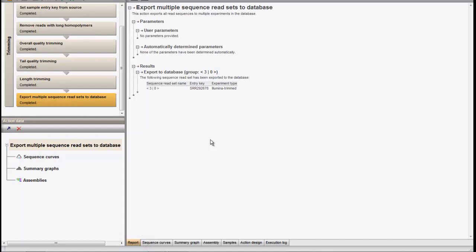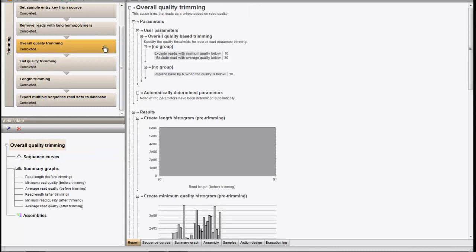From the report, the different parameter settings for each trimming action are displayed. When we take a look at the report of the overall quality trimming, the parameters are displayed on top and then the histograms are shown.